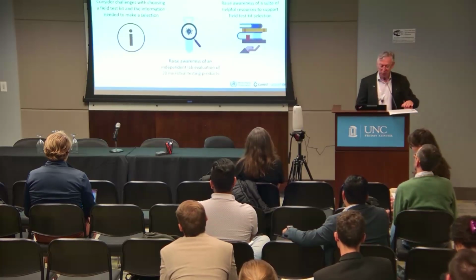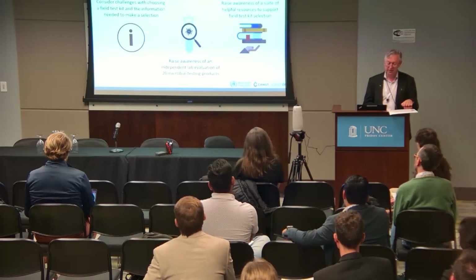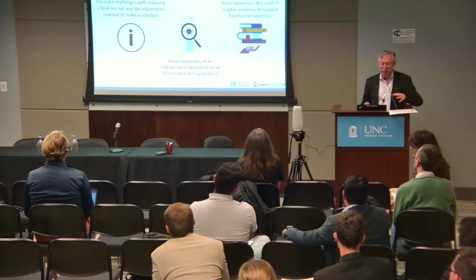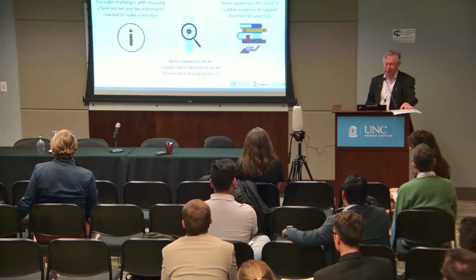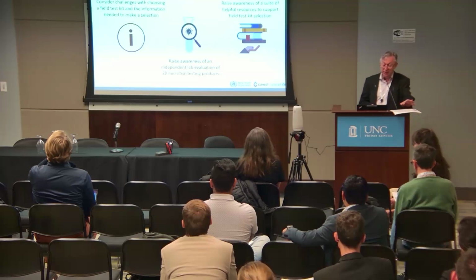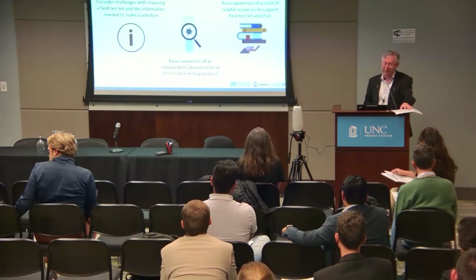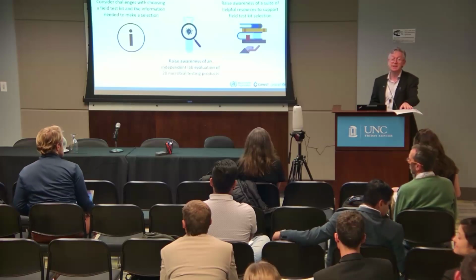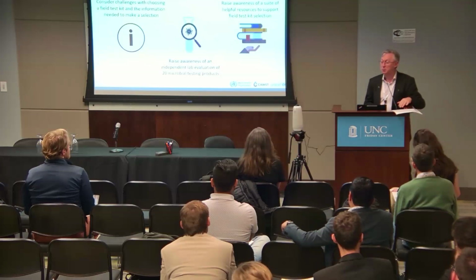The session objectives this morning are about really considering the challenges with choosing a field test kit. In so many sessions this week we heard about the important role that field test kit monitoring is playing in different parts of the world for different parameters. We'll also be raising awareness of an independent lab evaluation of 20 microbial testing products, and finally raising awareness of a suite of helpful tools and resources to support field test kit selection as you move forward and are choosing the best option for you.